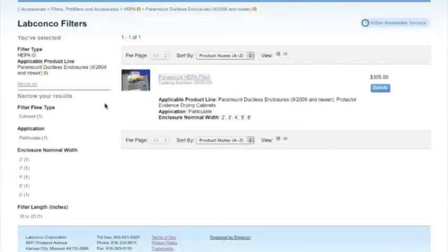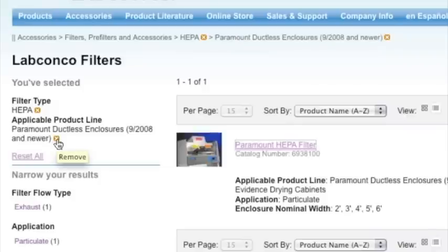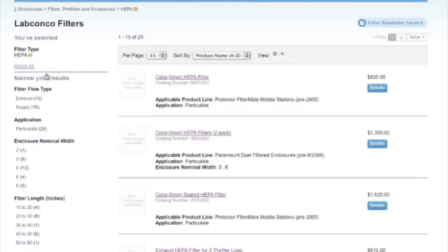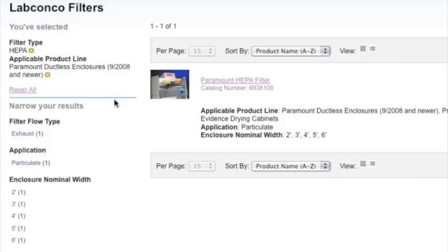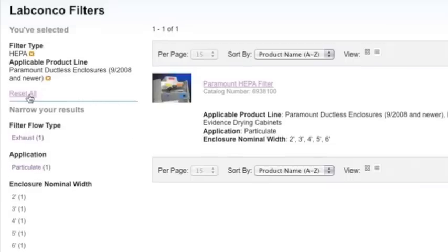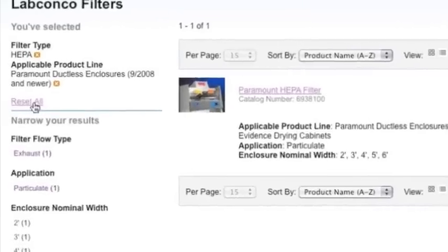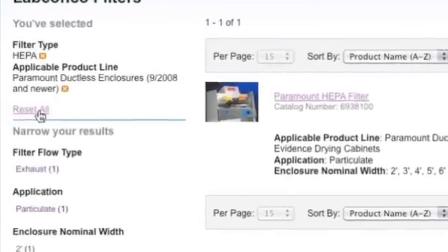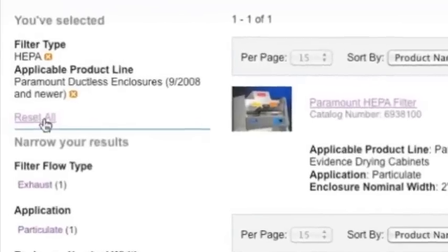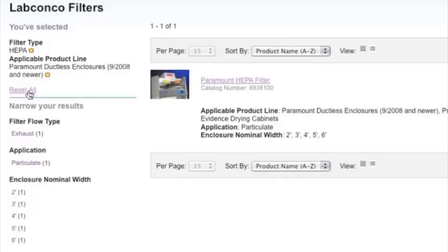To step backwards and remove a search criteria at any time during the search process, click the X in the orange box next to the criteria that should be eliminated. To clear all search criteria and start over, click the Reset All link in the left-hand column.